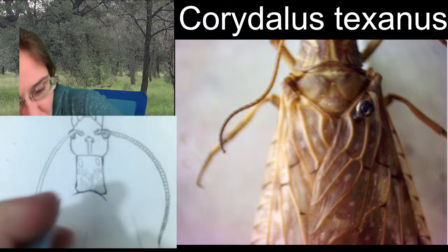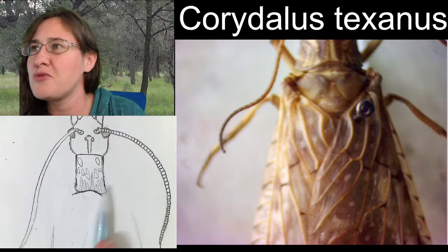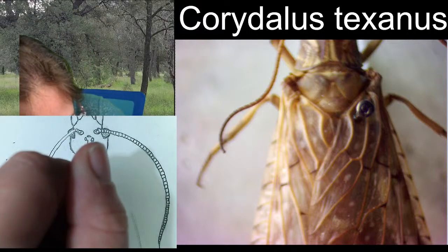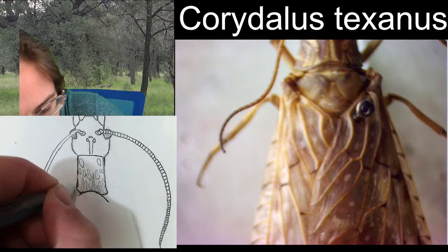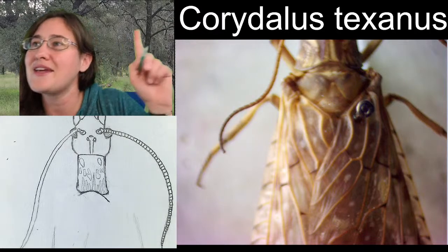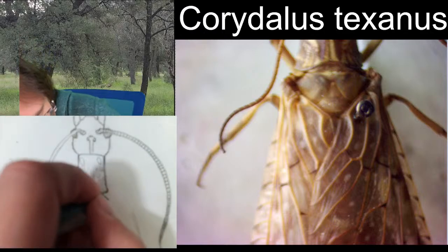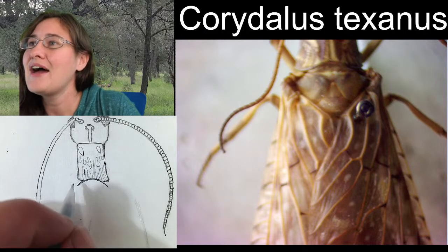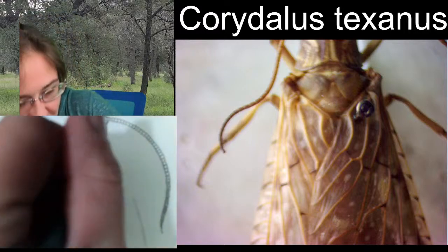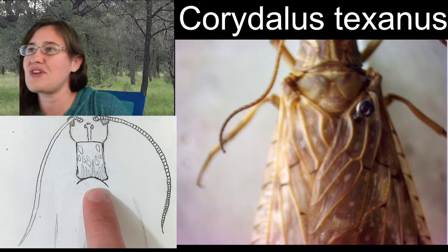All right. So that arch that you have from the edge of your pronotum, that's going to be your starting point for your scutellum-like segment in between the wings. Scutellum-esque. All right, so you've got that arch figured out, you want to bring it a little bit past the edge of the pronotum so that at least you've got it there.